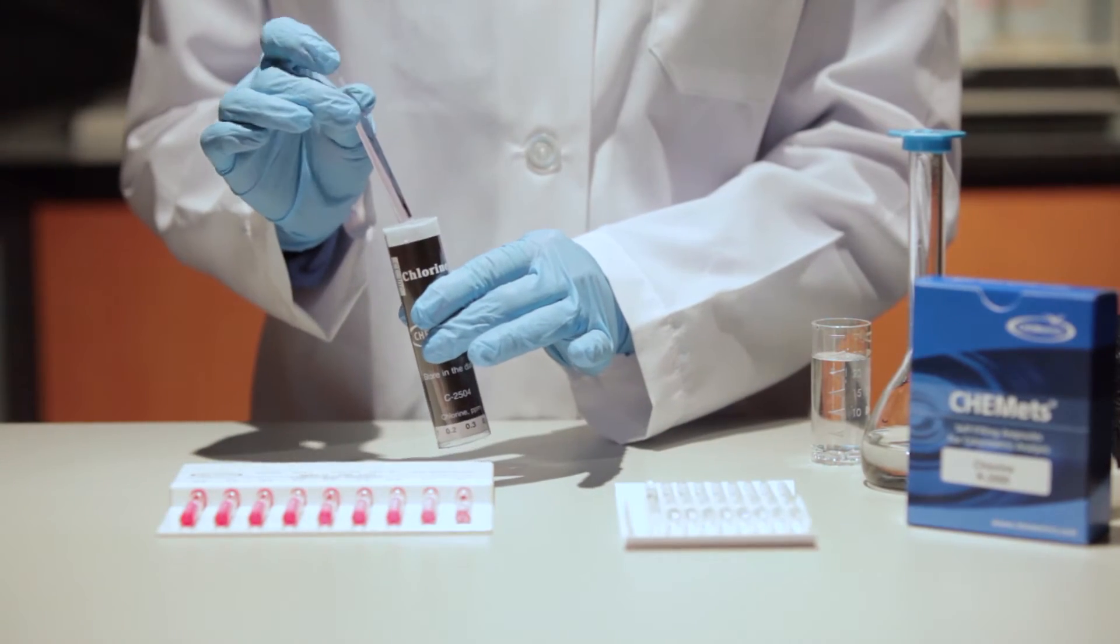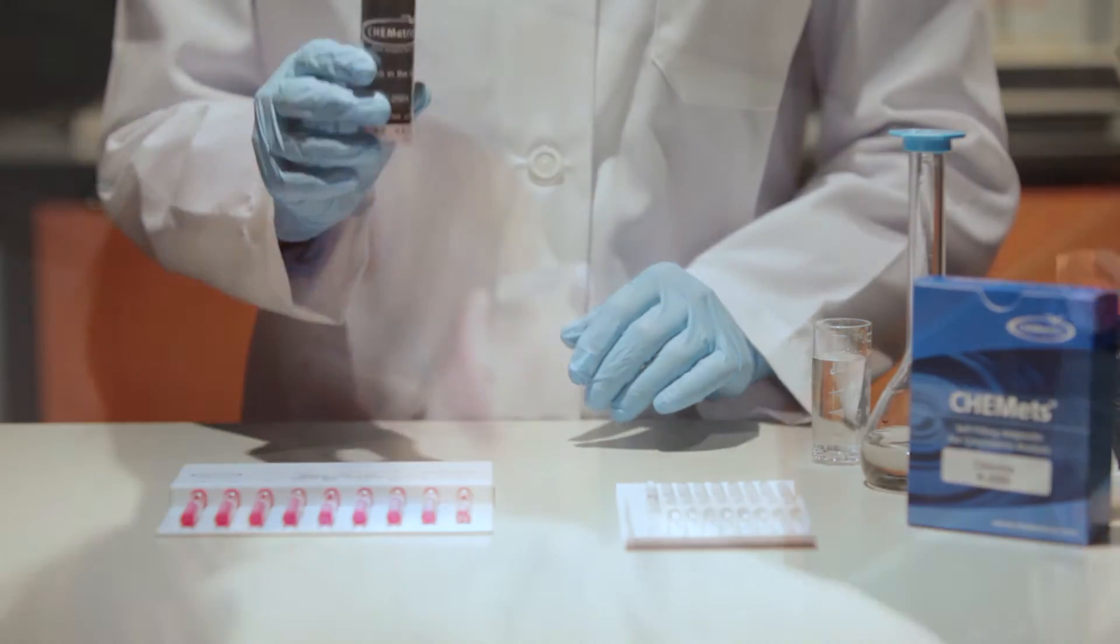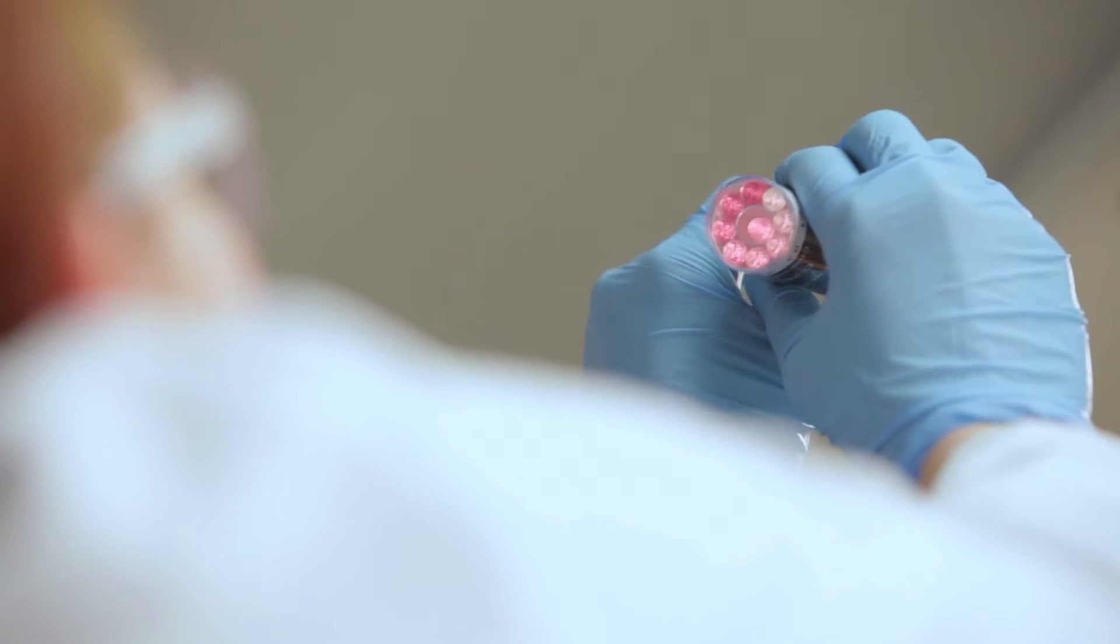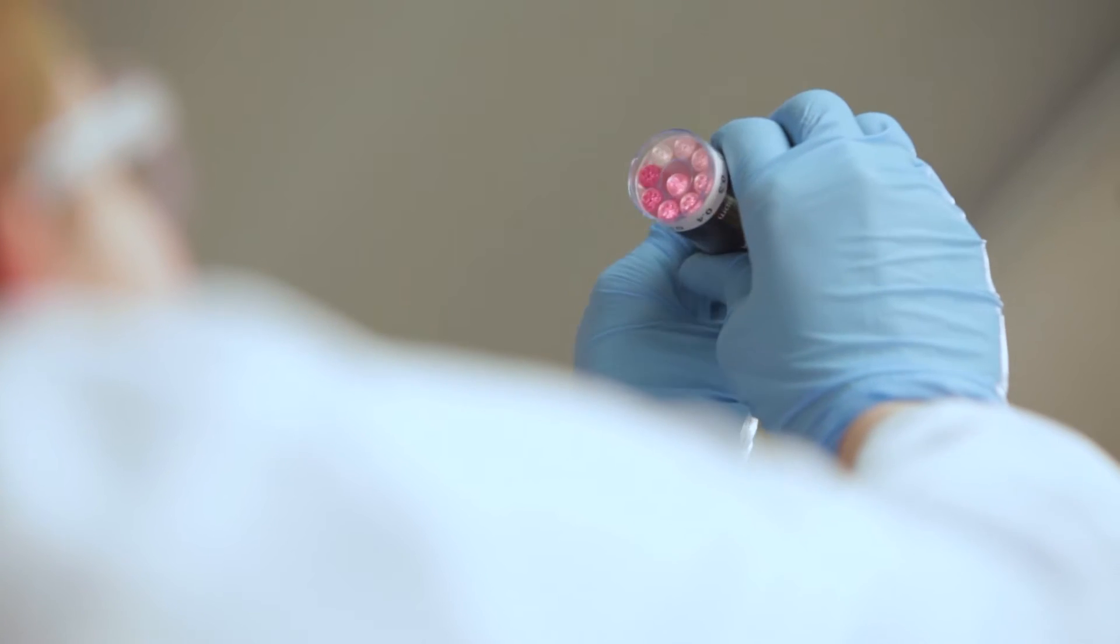For lower concentrations, use the round comparator by placing the ampule into the center tube. Direct the top of the comparator up toward a source of light while viewing from the bottom. Rotate the comparator until the color standard below the ampule shows the closest match. Concentration values are printed along the bottom edge of the comparator label.